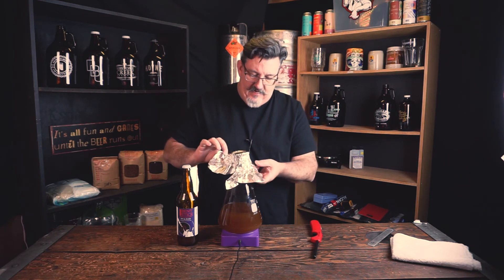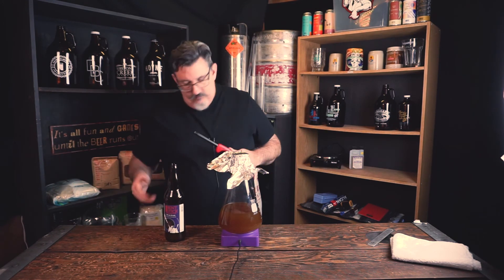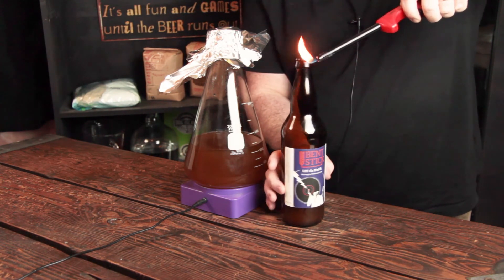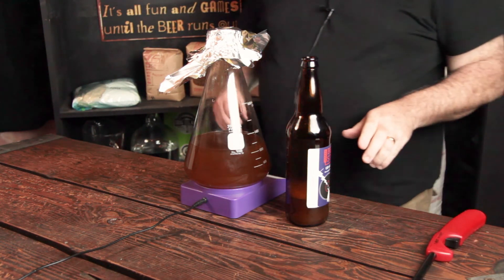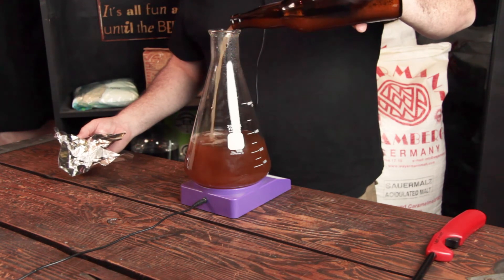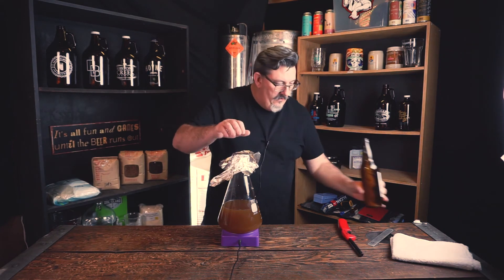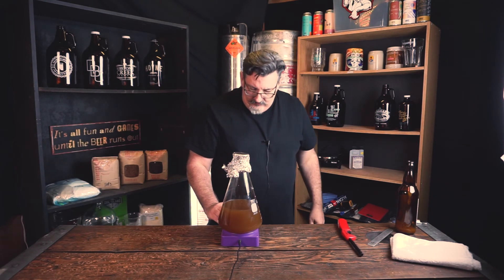I'm going to pull the foil off, loosen the cap, and get it off. I'm just going to flame the edge of the bottle to make sure there isn't any yeast or anything from my fingertips that might have gotten on there. And then we're just going to pour this straight in — you can see how cloudy that is. That's all of that suspended yeast, the Kvike culture, now going into the Erlenmeyer.